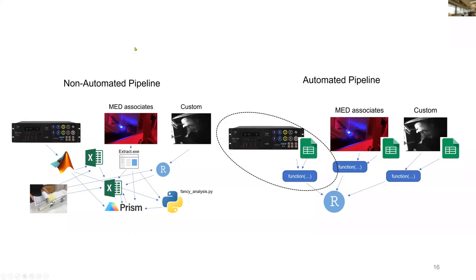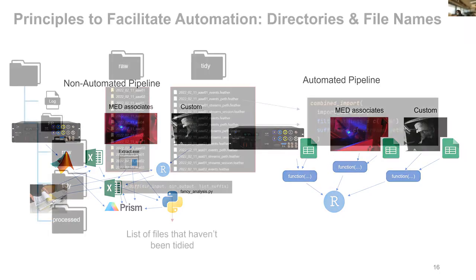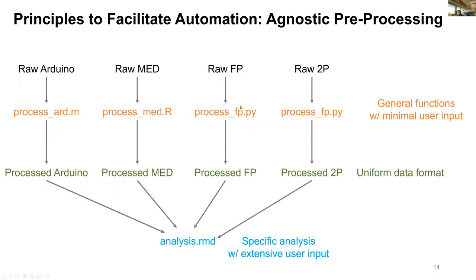All right, so hey Adam, I had a question. I was just curious, when you were talking about combining your two, or even up to 4 types of data streams using this uniform data format, how are you even syncing the data in a temporal stream? Because sometimes they're collected at different frequencies, or sometimes you hit start at a later date.